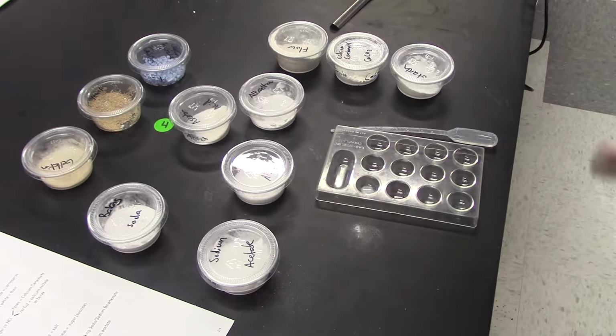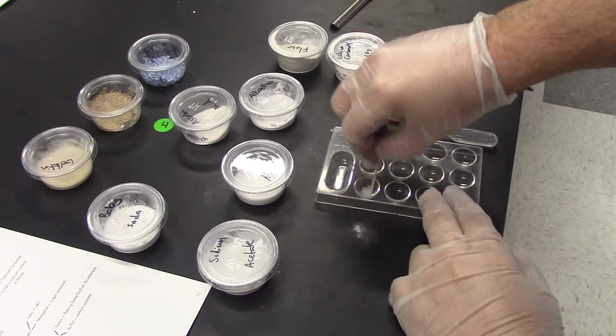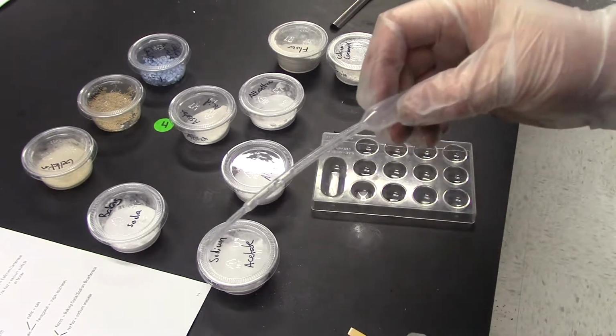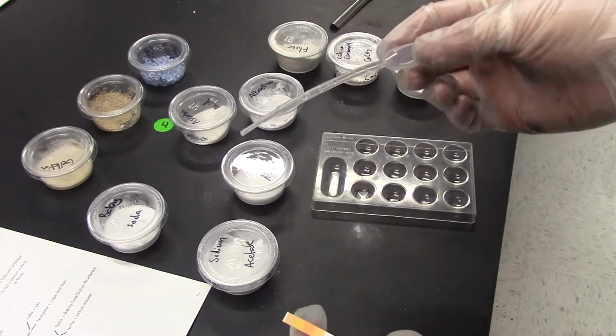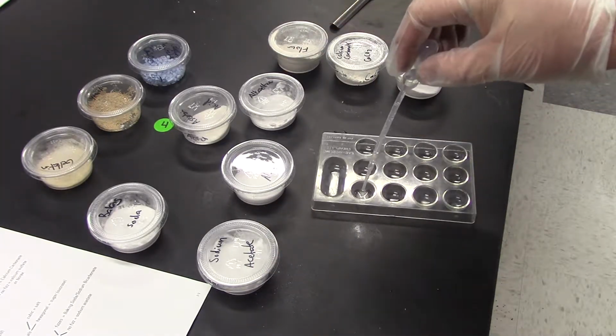Another thing that I would suggest is maybe have toothpicks with you as well, so you can mix these if you need to. Okay, so I've got a toothpick here. I'm just going to mix this up. And then I'm going to go ahead and test the pH of this. Anytime you're using a pipette and you need to do something new with it, you'll always want to throw it away and get a new one. This one has water in it, and I just mixed it in here.